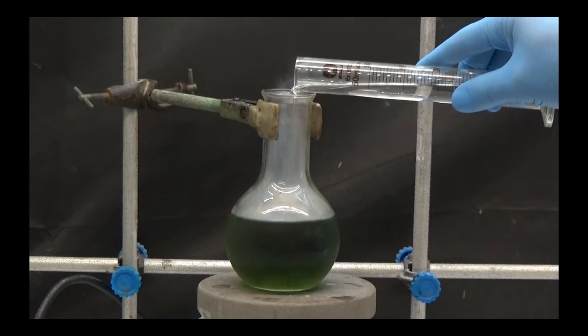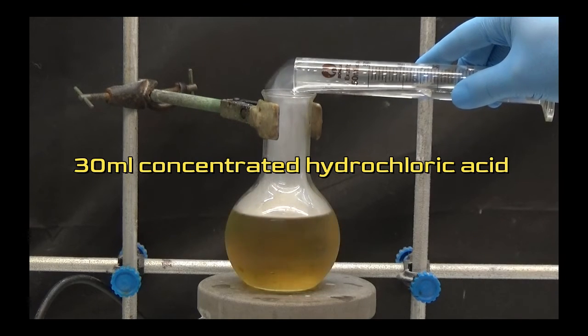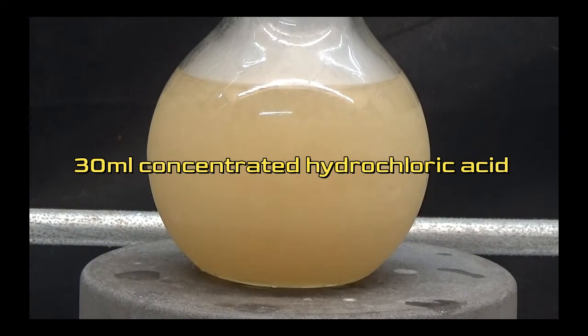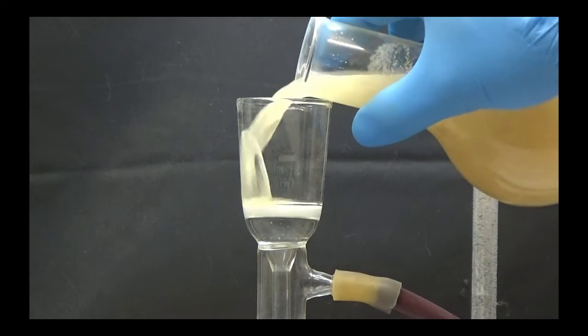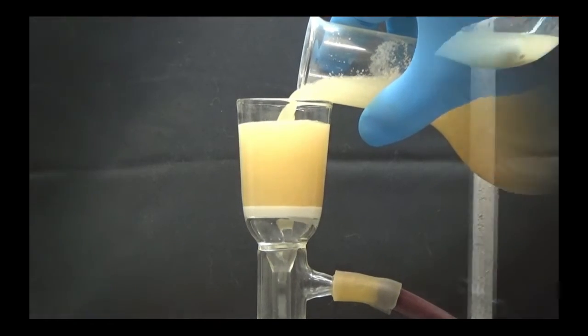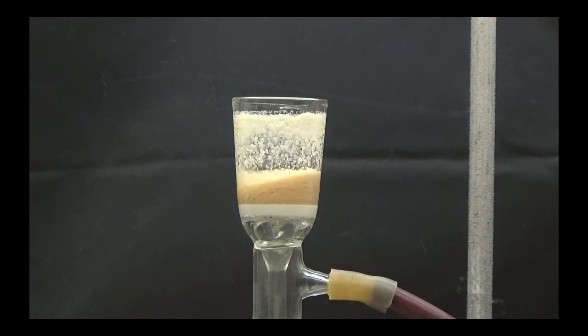With stirring, we add 30ml of concentrated hydrochloric acid and a brown precipitate is produced. Collect the precipitate by suction and dry it in an oven at 60 degrees for 24 hours.